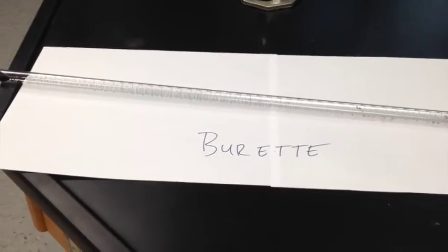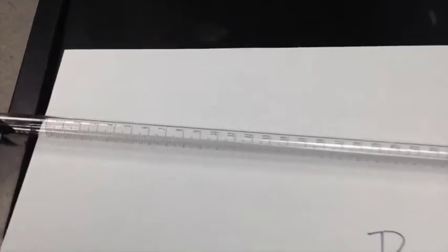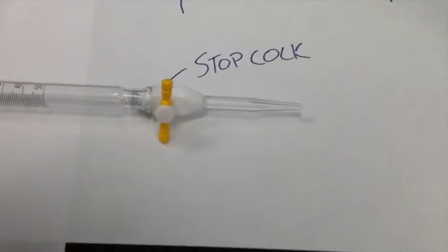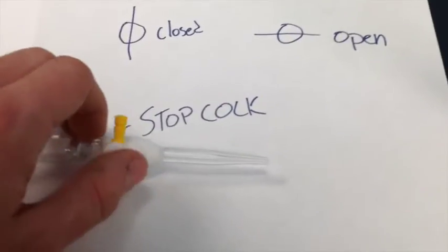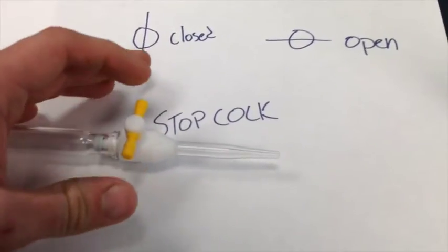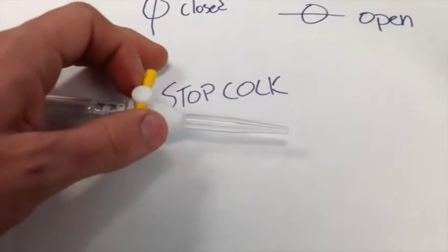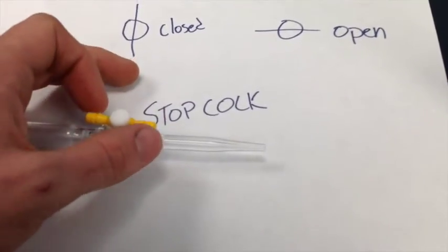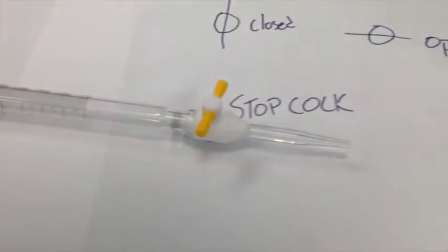So without further ado, let's head to the lab and introduce some new glassware, starting off with something we call the burette. A burette is a long graduated cylinder. You can see it's got numbers running the whole length of it that terminates in what's called a stopcock, which is just a valve that comes to a narrower piece of glass. This valve is closed when it's orthogonal to the tube, and if you turn it parallel to the tube, that's open, so liquid flows out. This stops liquid from flowing out.